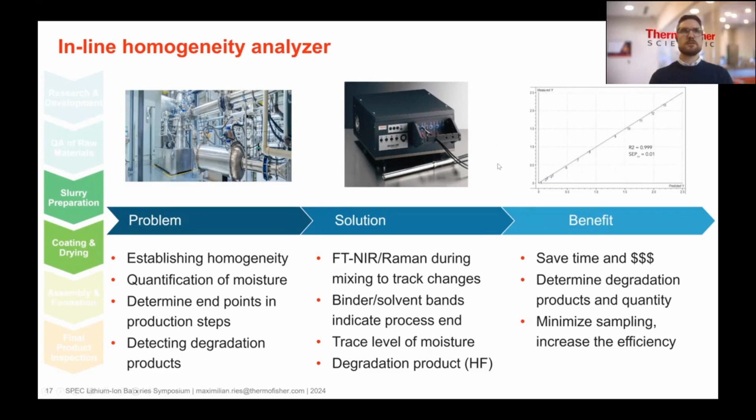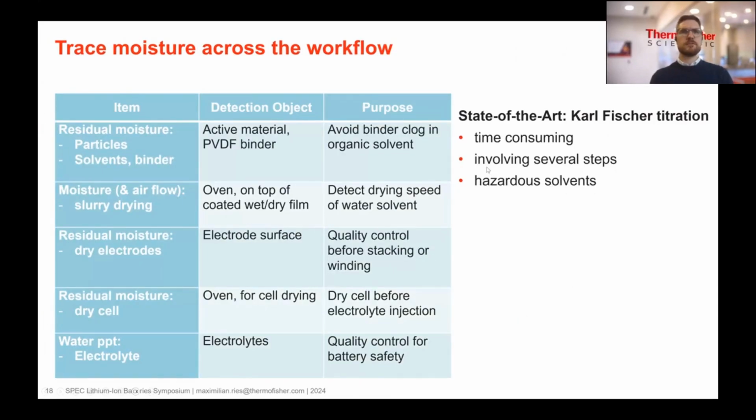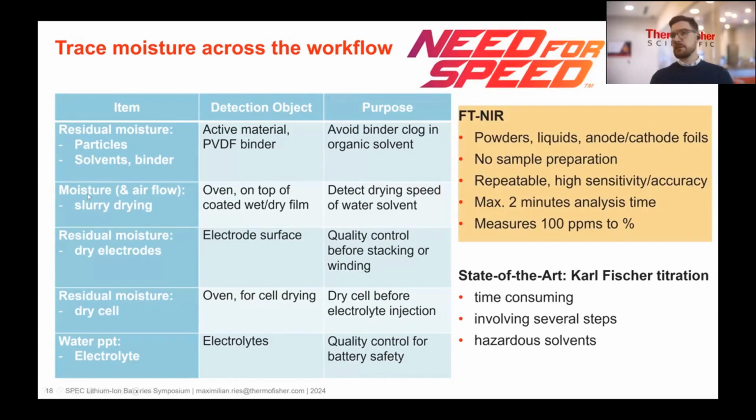And speaking of efficiency, near-infrared spectroscopy is a great technique to largely reduce the amount of Karl Fischer titrations that you need to perform in order to investigate the residual water across the whole battery workflow. I do not want to go into details about where and how water can interfere with different materials used in the process, but it can be a serious safety threat from, for example, binder clogging, and also become a monetary factor when we think about idle time in the slurry or electrode drying. State-of-the-art Karl Fischer titration is a time-consuming technique and operator-dependent, whereas near-infrared spectroscopy only needs about 2 minutes per sample. The technique can identify 100 parts per million to a few percent, but it also relies on a very precise reference method.